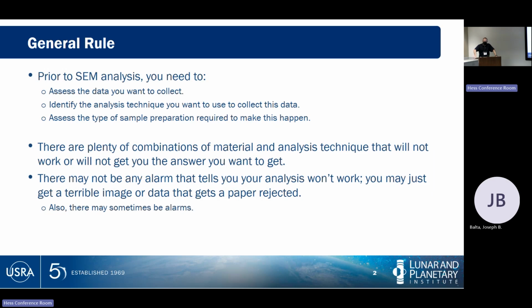And when you say, this is a fundamental issue, your SEM is giving you a data cloud that's not actually telling you anything about your sample, that's a bad thing. You don't want to waste your time on that. So assessing what you want to know about your material, what's the best way to do that analysis, and then how do I get the sample into a state where I can do that analysis is the set of steps I'm going to try to make us think through.